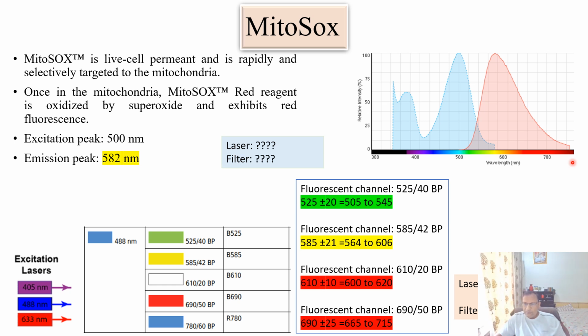Is it clear? Many colors will be emitted by this fluorophore. But again, you see the peak light, the maximum intensity, at a wavelength around 600 nanometers.